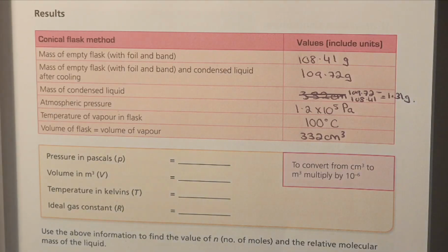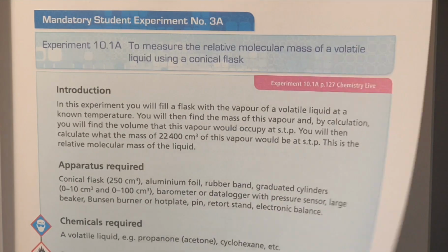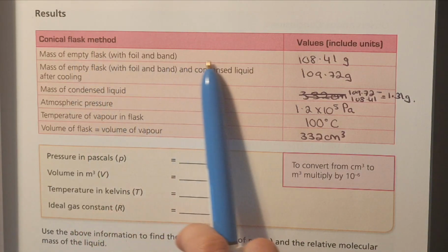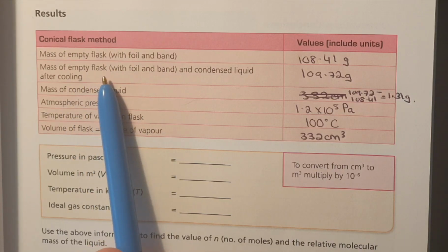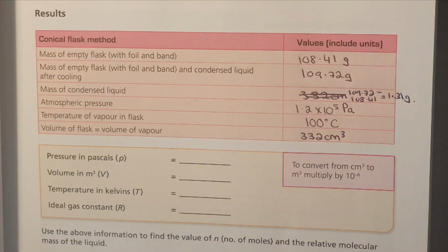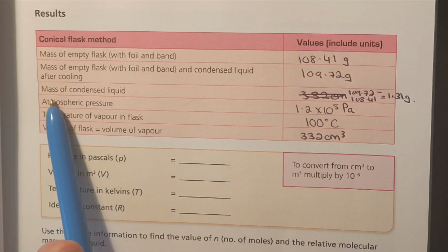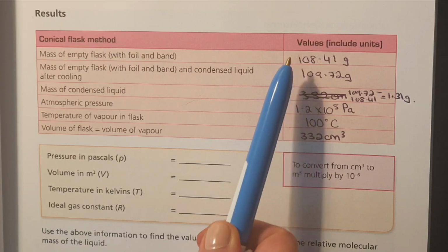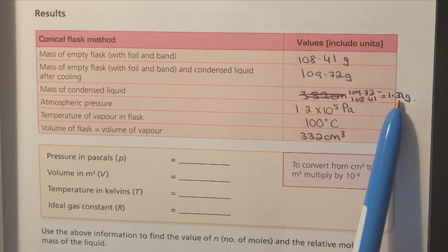Okay, so this experiment is the experiment to measure the relative molecular mass of a volatile liquid using a conical flask. So you should have gotten your own results here for the mass of the empty flask and then the mass of the empty flask with the condensed liquid after cooling. So that's the mass after the experiment is completed. The mass of condensed liquid then, all you have to do is take these two numbers that you've gotten away from each other. And I got around 1.31 grams for this one.